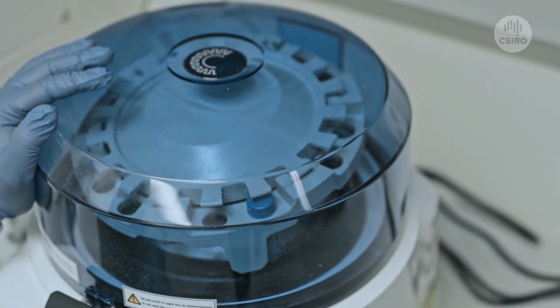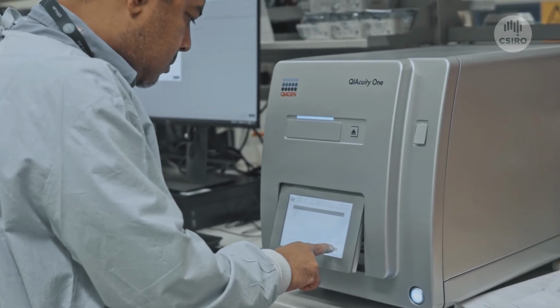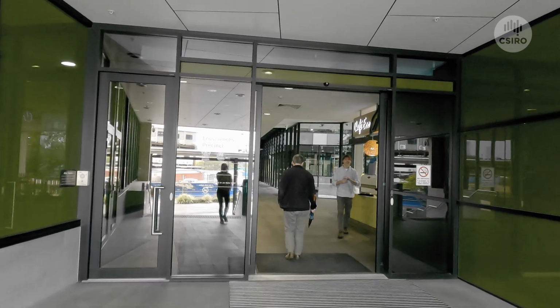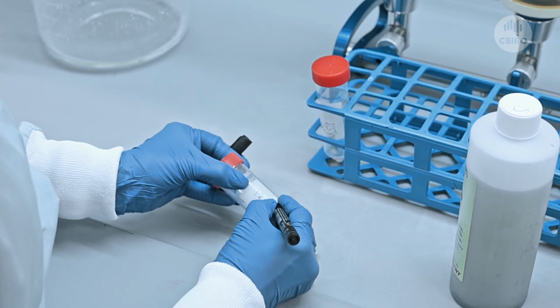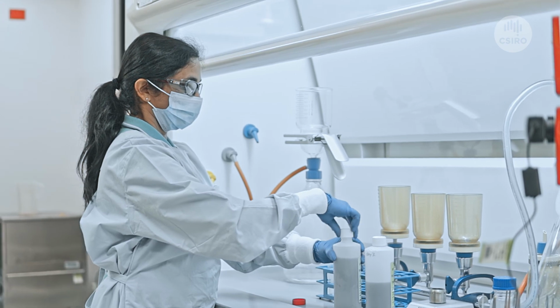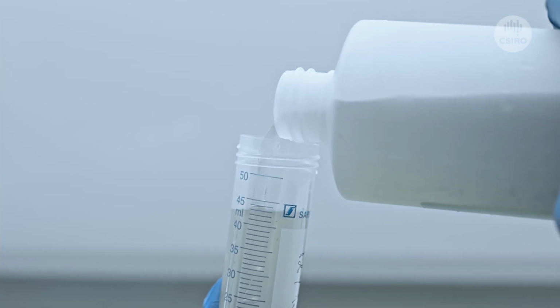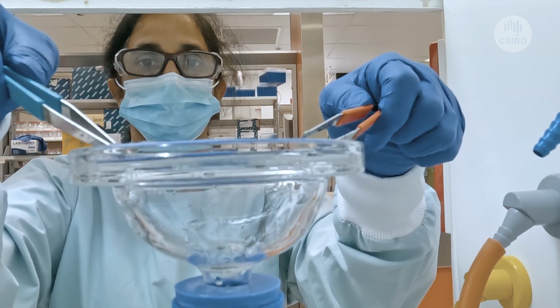We receive up to 100 wastewater samples per week from 45 wastewater treatment plants across Queensland. Delivery of samples is managed by our collaborators from University of Queensland, whereby a documented chain of custody form is recorded, signed and logged to track movement of every wastewater sample. Our lab has the capability to process up to 200 samples per week. The sample analysis process is complex and involves many steps and specialized instruments.